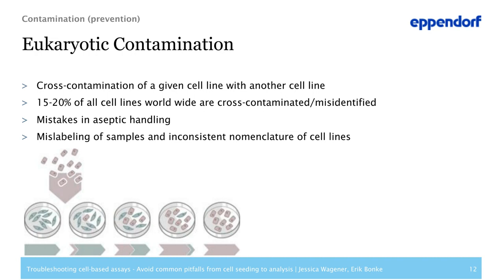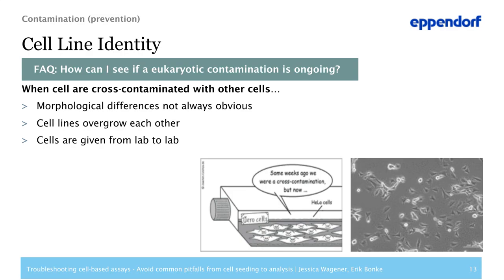A misidentified cell line develops from a cross-contamination of two different cell lines. It is estimated that 15–20% of all cell lines used are either cross-contaminated or misidentified. Cross-contamination usually happens by accident during handling of cells, and mislabeling of samples or inconsistent nomenclature also contribute. As soon as two cell types are mixed up, it is very hard to distinguish them, especially if the morphology is not drastically different. Faster-growing cell lines overgrow and replace slower-growing cells, especially when cell stocks are passed from lab to lab without any quality control.